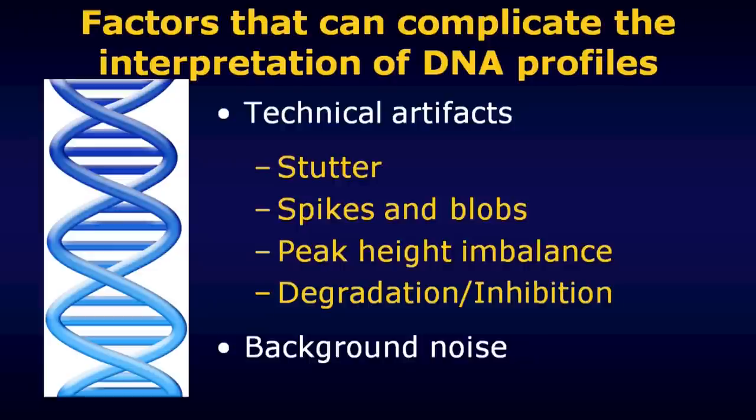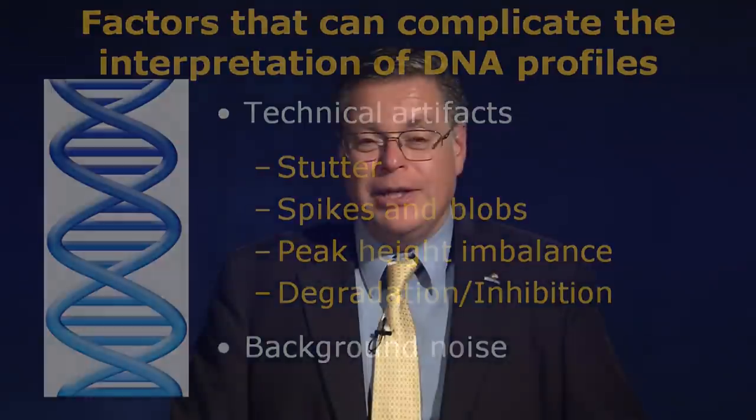It's not always black and white. There can be shades of gray in terms of interpreting. Is this an artifact? Is this noise? Or is it signal? Is it something that tells us there's an important DNA contribution to a sample? Where there's room for debate, there's room for argument in court about what weight should be attached to these samples. And that is probably the crux of the issue here. But for now, I think we can wrap up this particular talk. This has been my effort to have a video that gets you up to speed about complicating factors associated with the interpretation of DNA testing evidence.